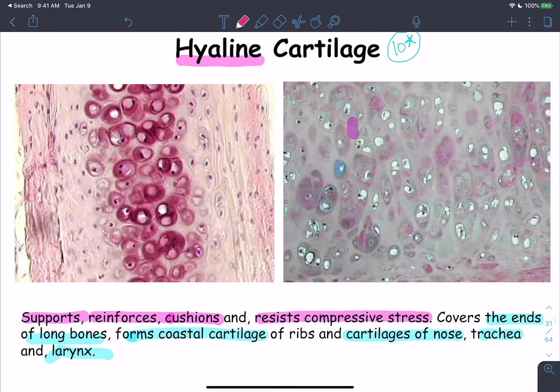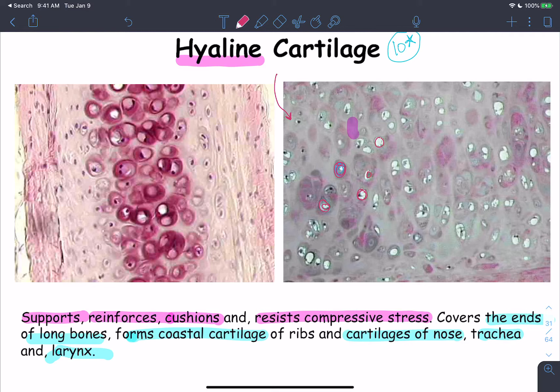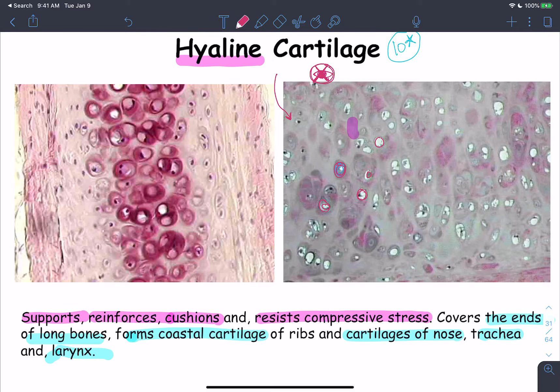Moving on to cartilage: the major characteristic used to identify cartilage is the presence of chondrocytes within their spaces — chondrocytes within lacunae. To differentiate between the different types of cartilage, we rely on the type of fibers in the matrix surrounding those chondrocytes. If the matrix has a homogenous consistency and I cannot see any fibers, this is the hyaline cartilage.